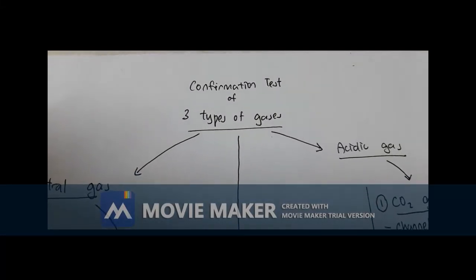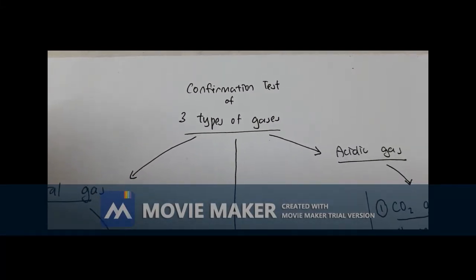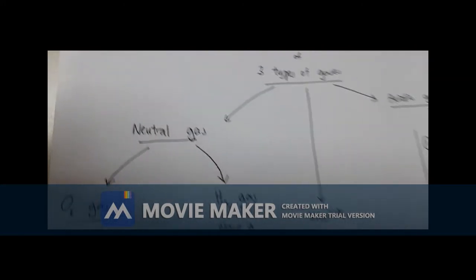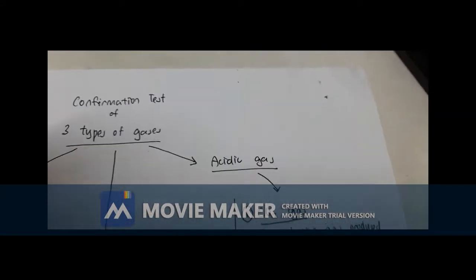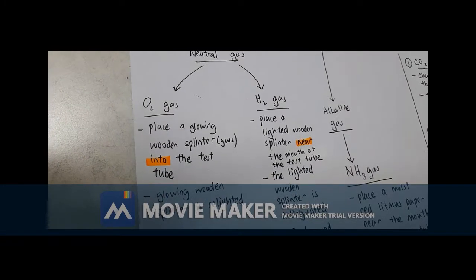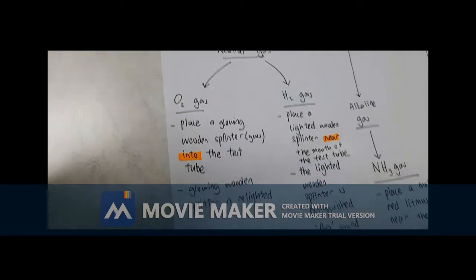Hello, my name is Sanjana, and today I'm going to be talking about confirmation tests of three types of gases, which are neutral gas, alkaline gas, and acidic gas. So let's start with neutral gas. First we have O2 gas, or oxygen gas.